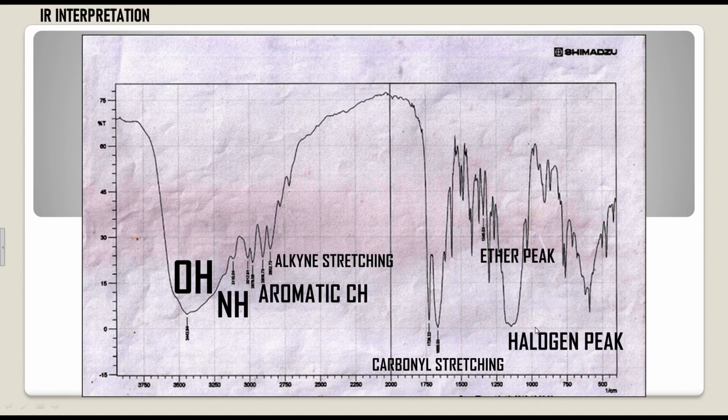So what you need to know to interpret the IR spectrum in the sense, you need to know what are the functional groups, how the functional group used to look, and second one, how I can dismantle the structure based on the functional group, then what are the factors involving the absorption of IR radiation, finally where this factor lies in the zone, IR spectrum zone.